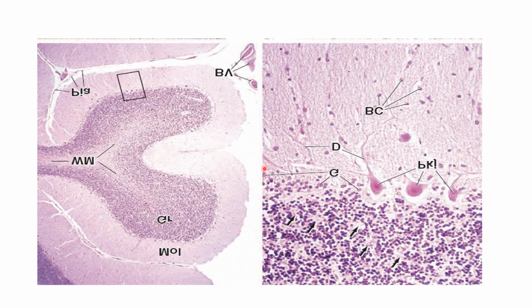This is just to revise again. This is the white matter. Then we have the blood vessels in the pia mater, then the granule cells, and this is the molecular layer. Granular layer, molecular layer, and the slightly bigger dots are the Purkinje cell layer. Then we have the dendrites of Purkinje cells. These are the basket cells. These are the smaller islands which are showing the synaptic glomeruli.